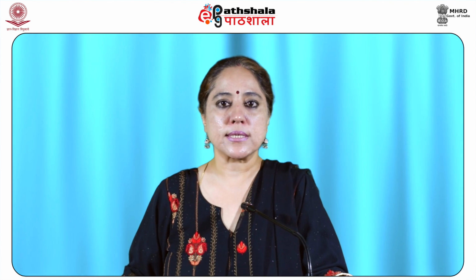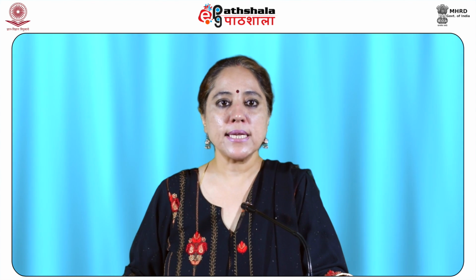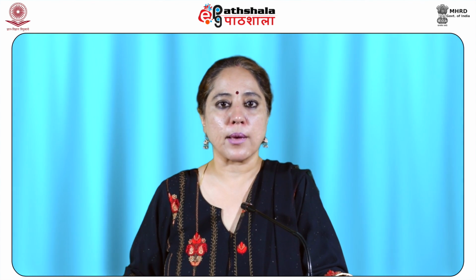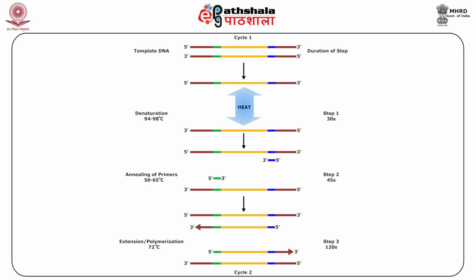Since primer sequences are complementary to the template strand, hydrogen bonds are formed between the primer and template DNA. The polymerase then binds to the primer template hybrid and initiates the DNA synthesis. The next step is the extension or the elongation step. In this step, the temperature and duration to be used rely on the kind of DNA polymerase taken for the PCR and also on the quantity of the amplification required.